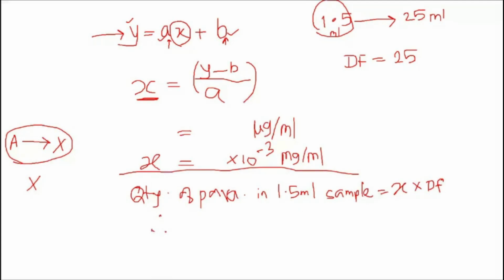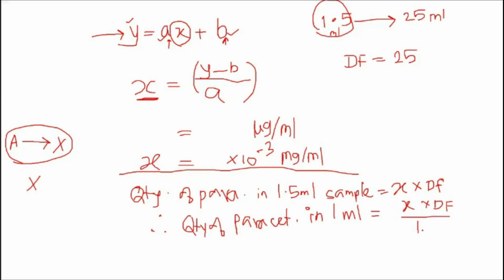Therefore, the quantity of paracetamol in 1 ml: if it is 1 ml, I will need to divide this quantity by 1.5.